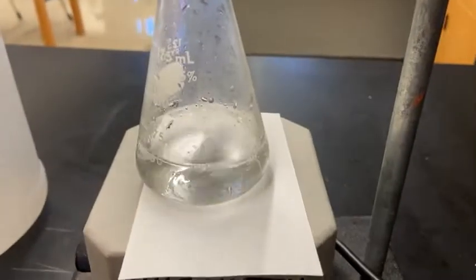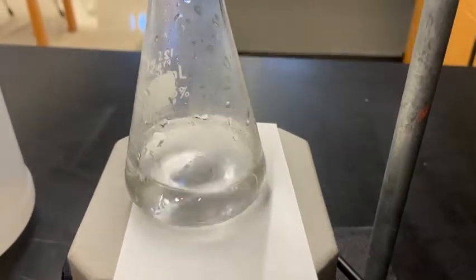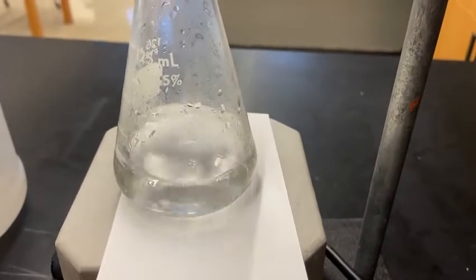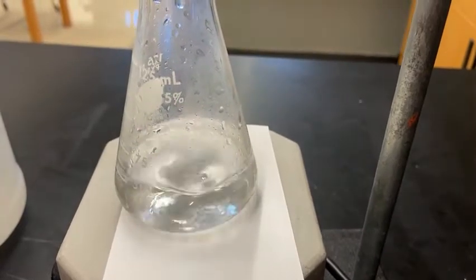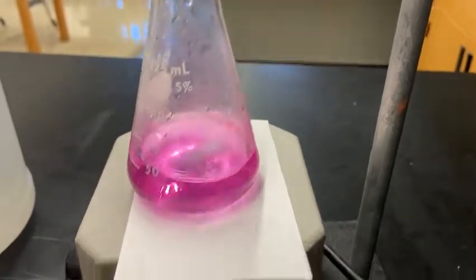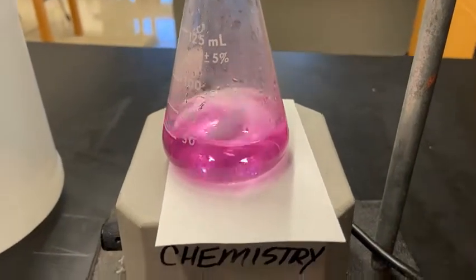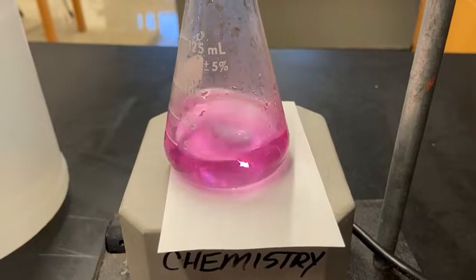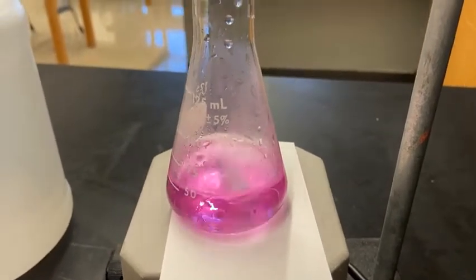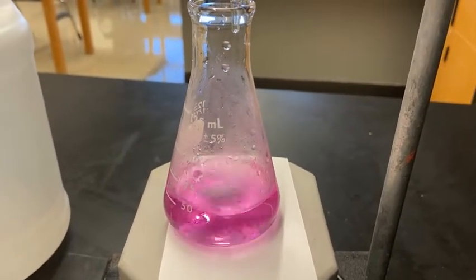The solution is still clear, but one drop and you can see the color disappears very slowly — we're very close to the end point. I'm going to add each drop slowly now. That's one drop — and I went too far. That's a bad trial, so we're going to have to discard this data and do another trial. Please erase your data for this one. I added a couple of extra drops past the end point.